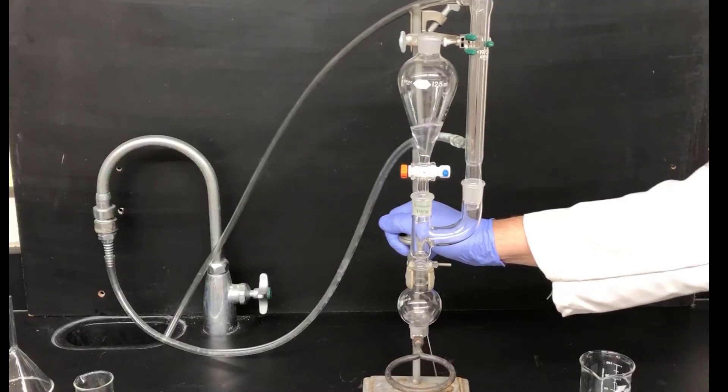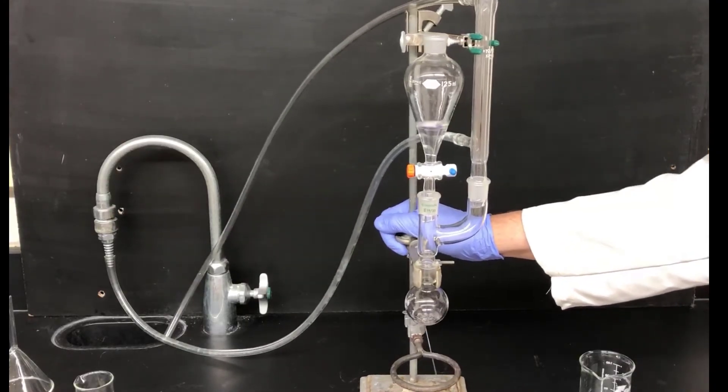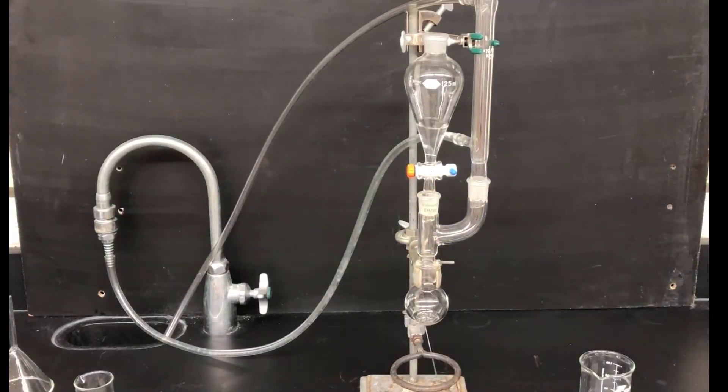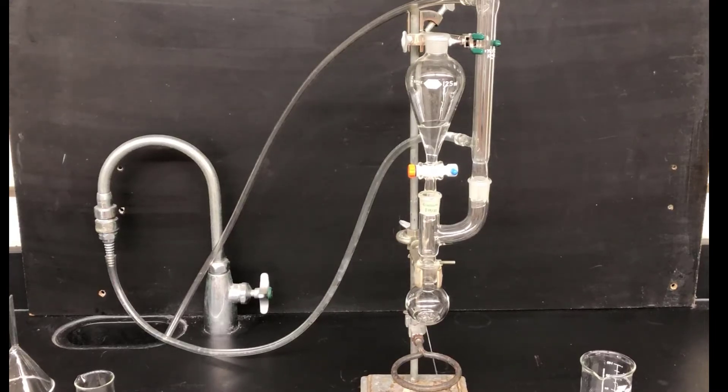Now we watch and wait for the Grignard reagent to start forming. You'll be able to tell something is happening because you'll see kind of a white or grey cloudiness develop in the solution, which will eventually give way to a yellow and brown color. You may also see bubbles forming on the magnesium, which is the exothermic reaction occurring and boiling the ether solvent. That boiling will become vigorous once the reaction has really started. Watch the reaction at room temperature for about 5 minutes or so and look for any evidence that it's started. If you don't see any cloudiness in that time, we'll have to get a little bit more aggressive in trying to get the reaction started.